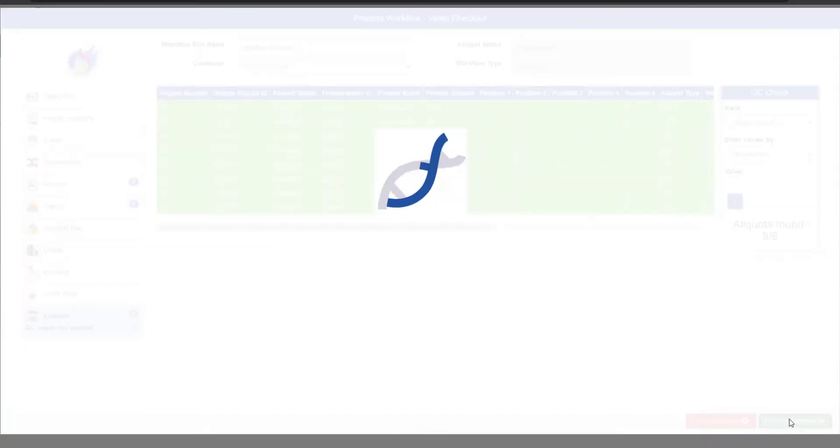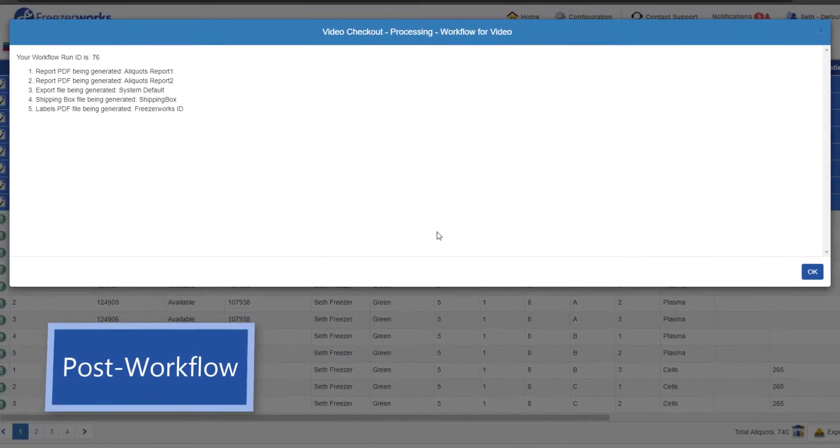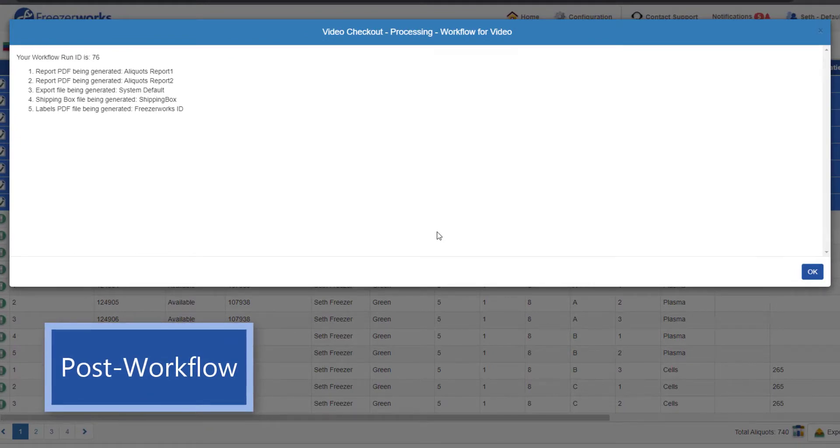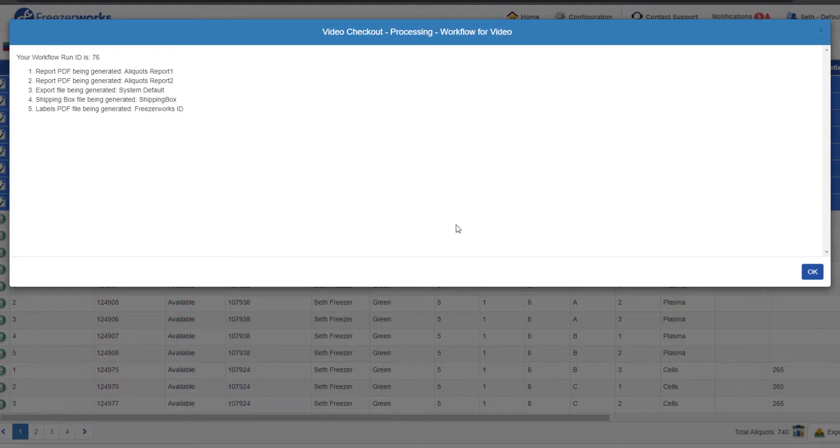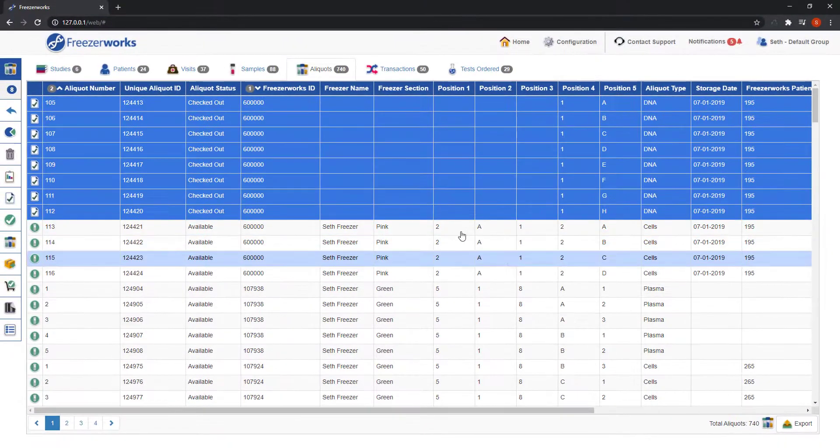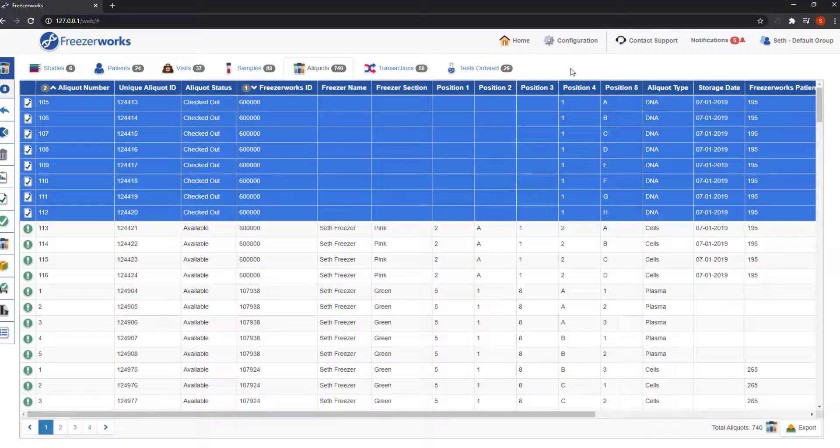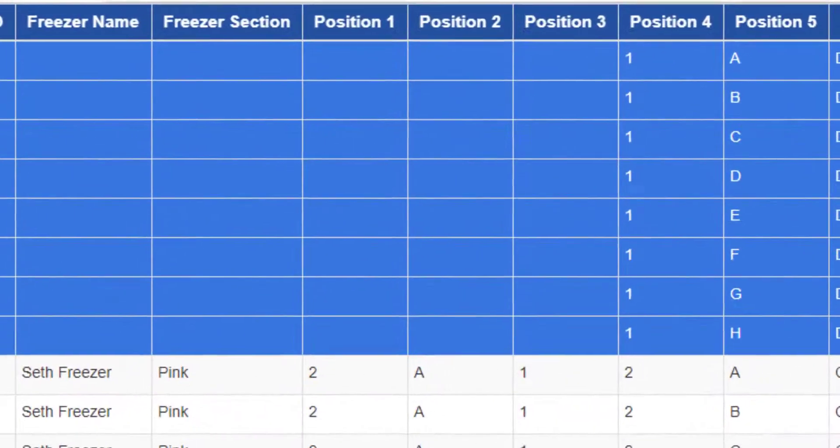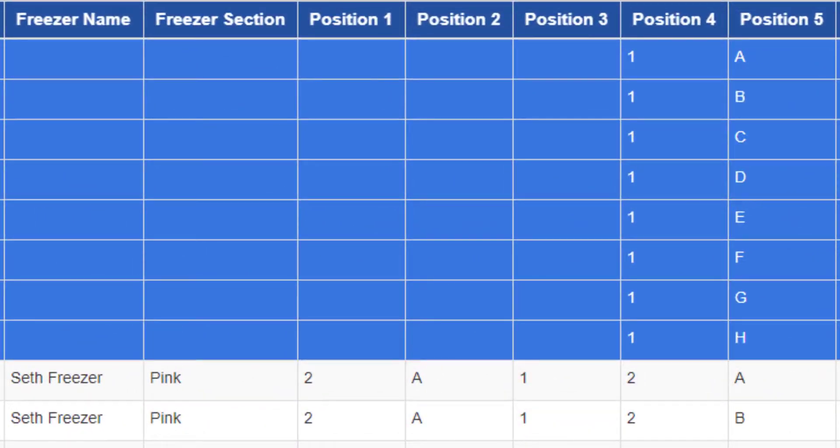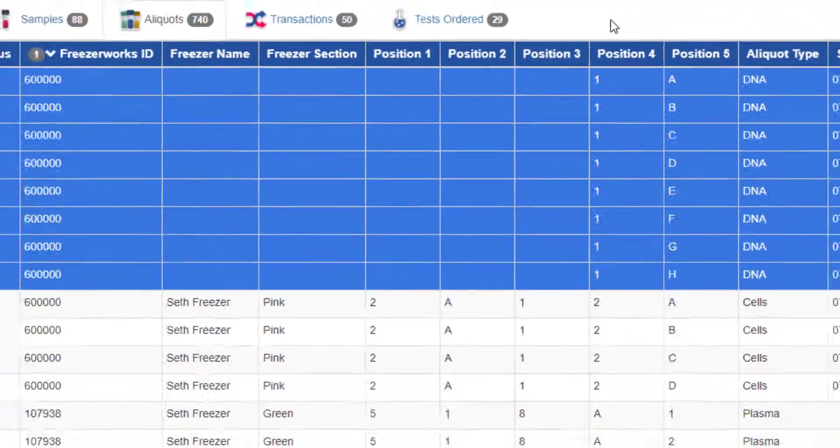So, click process workflow and a confirmation will appear. This tells us the various reports, exports, shipping boxes, and labels that were generated by the workflow. Click OK and you will be returned to wherever you started the workflow. All the changes you made to the aliquots will be immediately visible. Take special note of the empty freezer fields. We selected keep aliquot position during the workflow, so everything except positions 4 and 5 have been deleted. These fields will be used when we check the aliquots back in next time.